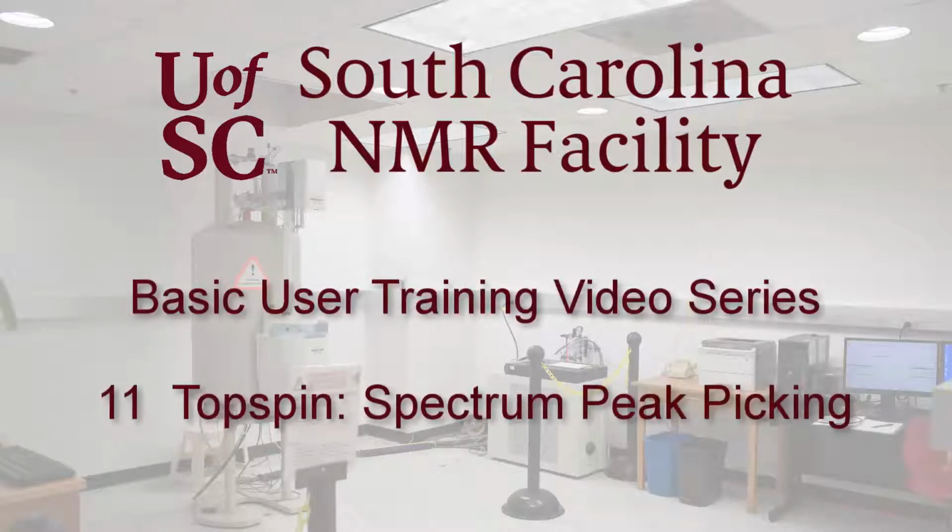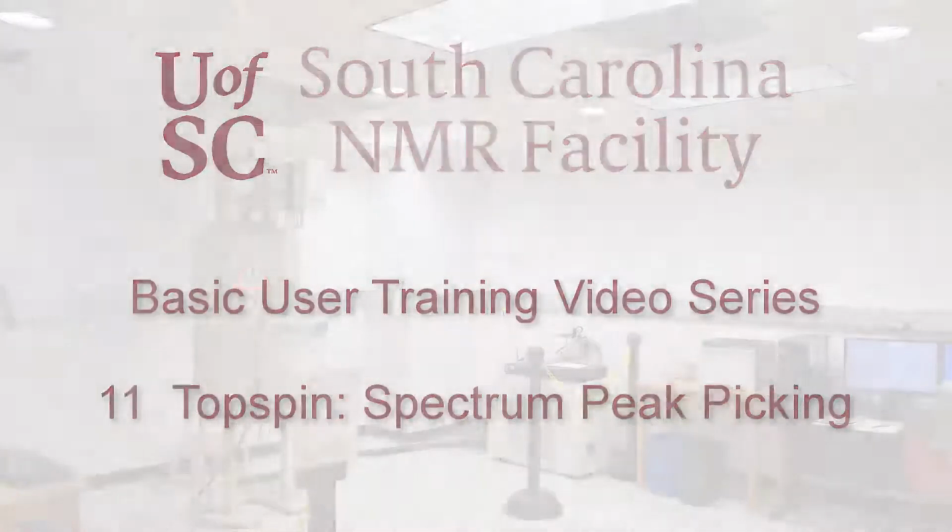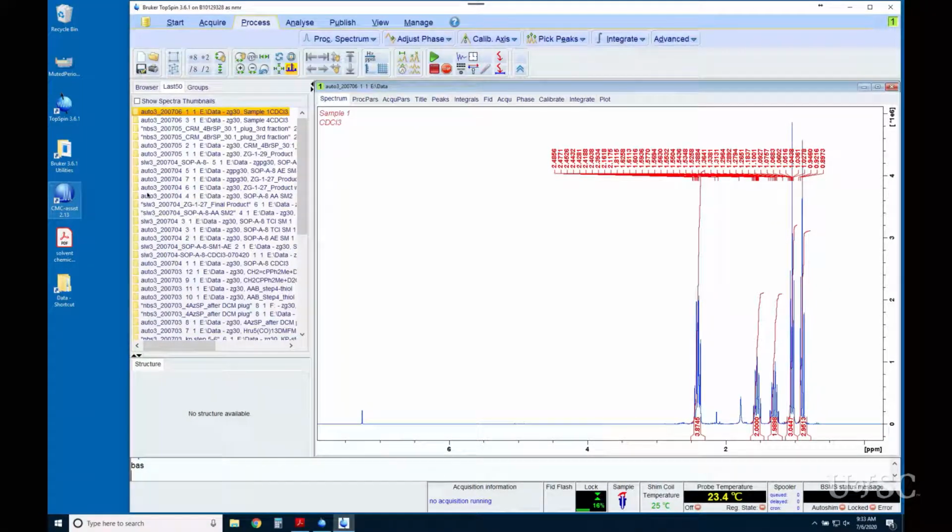Icon NMR processing will give peak labels that show their chemical shift positions. If you re-referenced the chemical shift scale, these values will be erroneous and need to be updated. The process of creating these labels is called peak picking. There are several ways to do this.